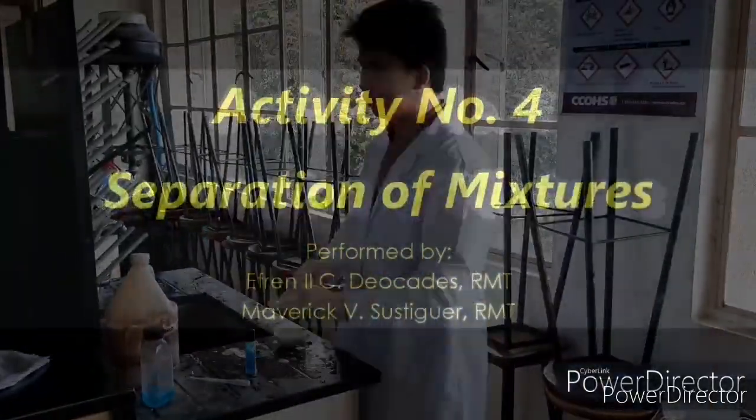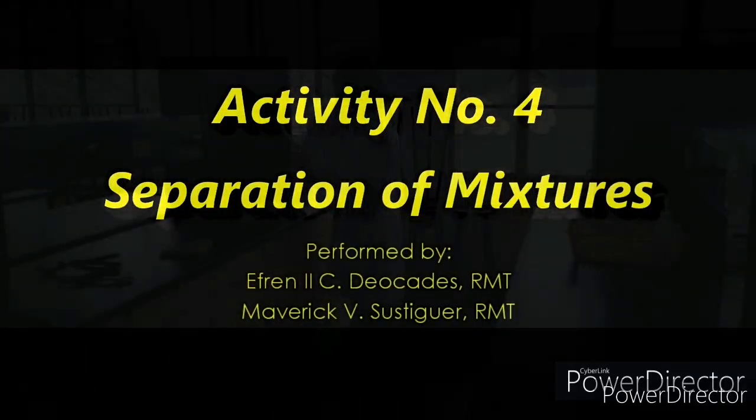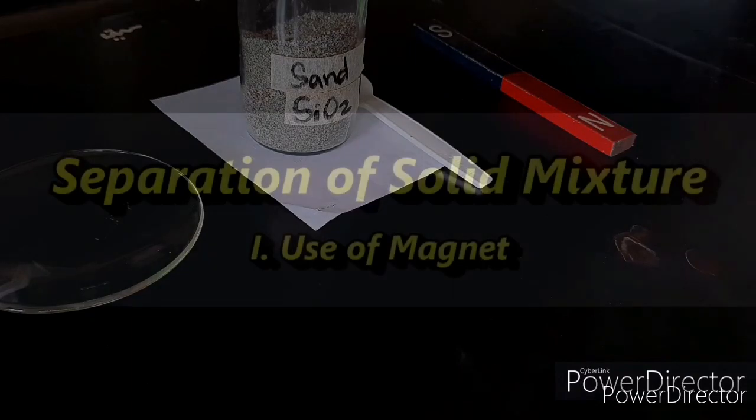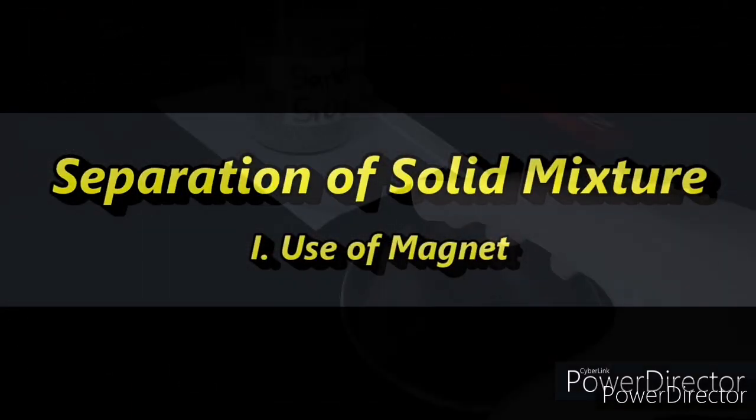Activity number 4, Separation of Mixtures. Separation of solid mixture, use of magnet.